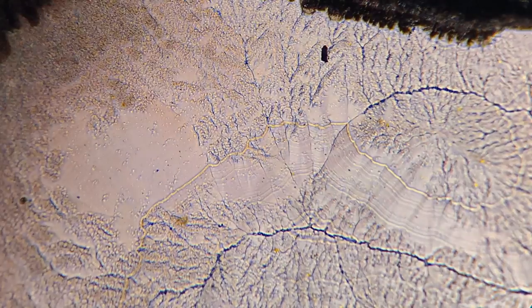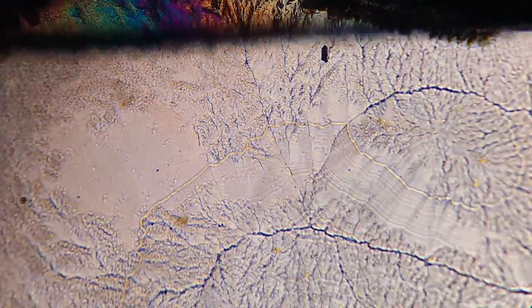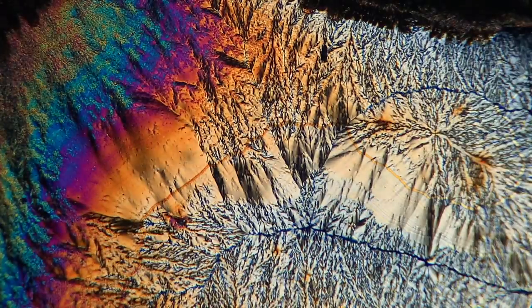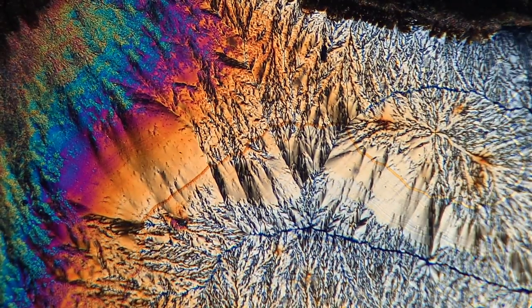Before I showcase all of the really cool art, I wanted to show what it looks like with the polarized filters. I'm just moving it back and forth so you can see what it looks like when we're bending the light and when we're not bending it.